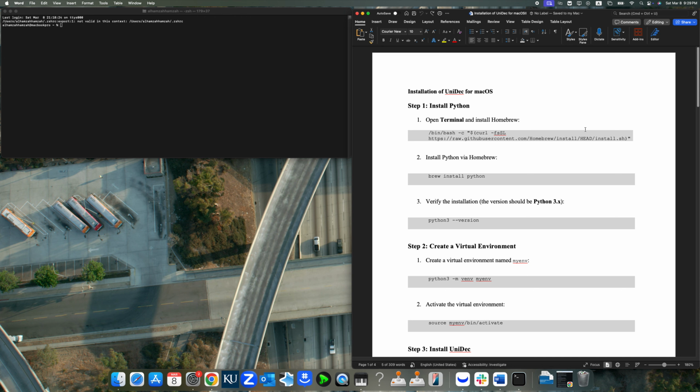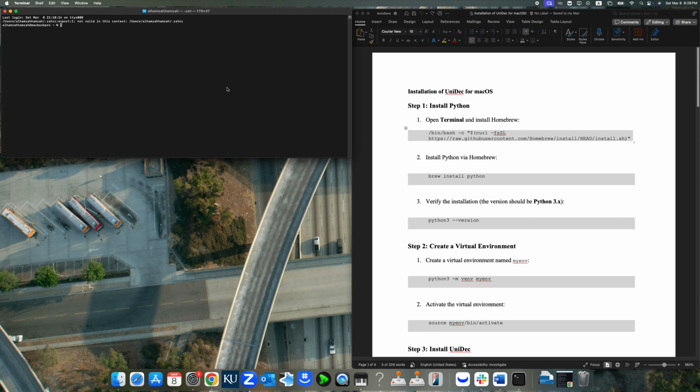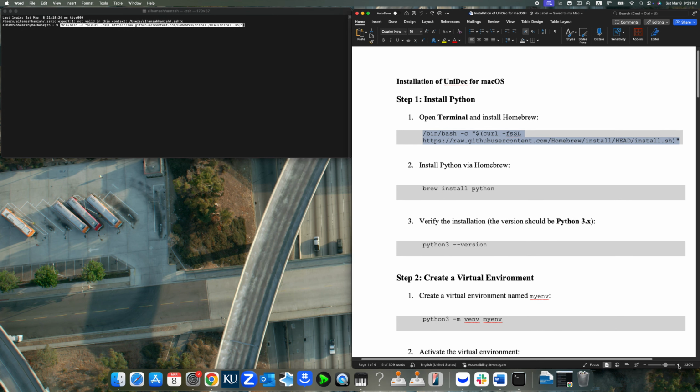So to install Python, first we have to go and install Homebrew. I'm going to leave these instructions for you. I have created the instructions, and I'm going to leave them in the comment section or within this video. So just look for it.